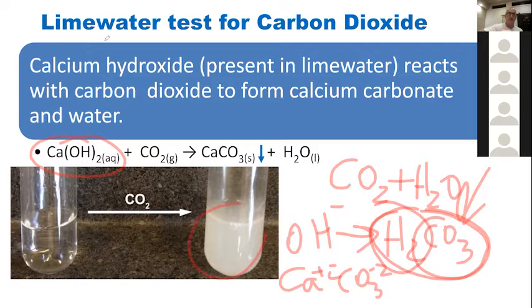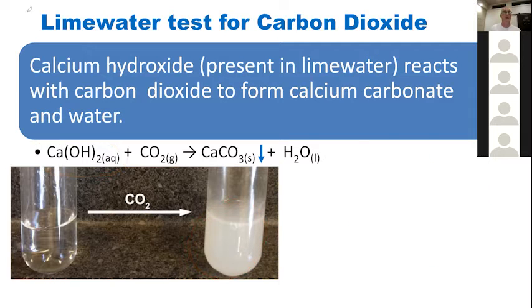This is the suspension that I was talking about. If you left it overnight, eventually it would fall to the bottom, but it takes a long, long time for that to take place. So you get this sort of milky suspension. I'm going to try and make that work, though like I said, I make no guarantees. So that's what that particular reaction is.